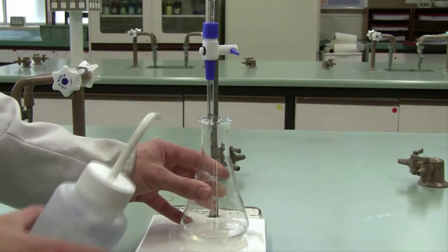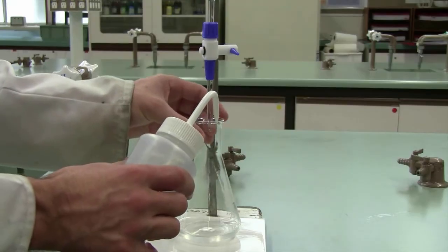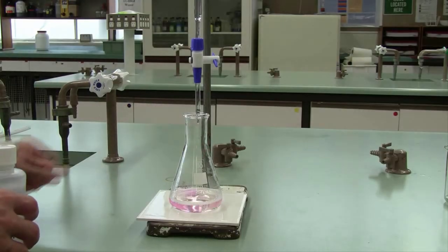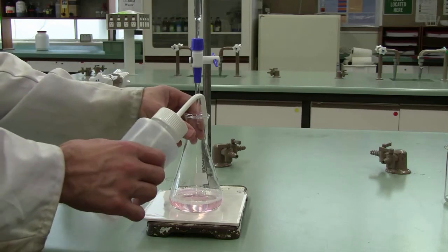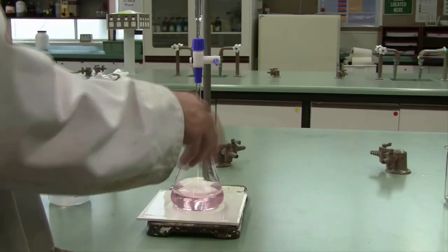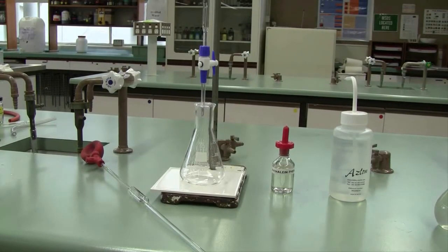Take your wash bottle and wash down the walls of your flask, washing all of your titrant down into your reaction. If your titration has gone strictly to plan, it will be a half drop that takes you from not quite being at the endpoint — still having a clear and colorless solution — to having a faint light pink throughout your solution. Once you reach this point, stop your titration and take your reading to two decimal places. You'll know the exact volume of sodium hydroxide required to react with 20ml of your dilute lemon juice.